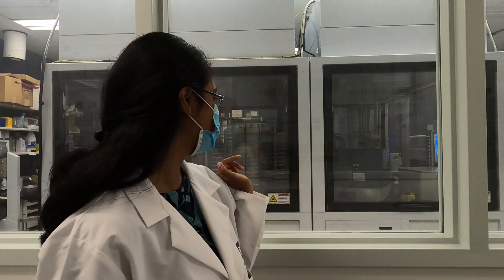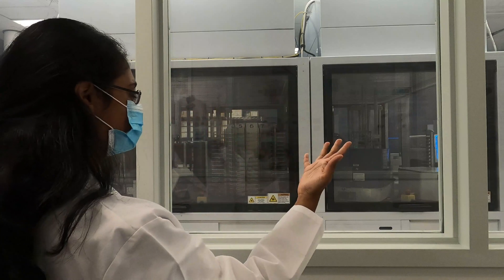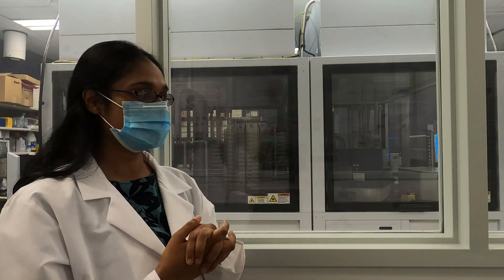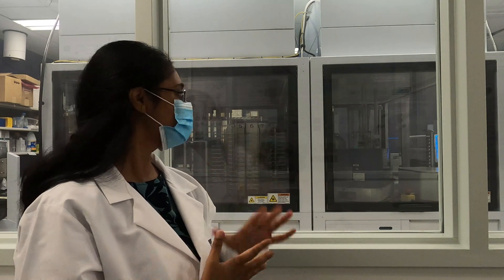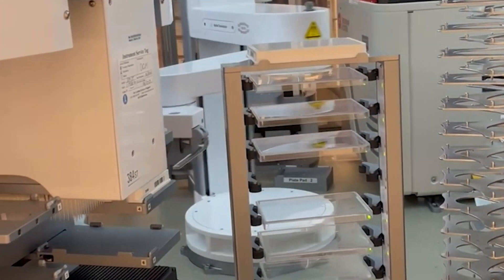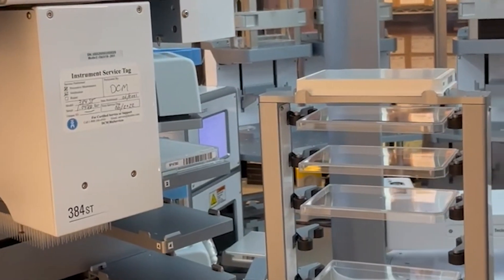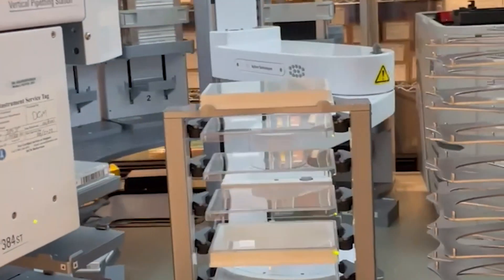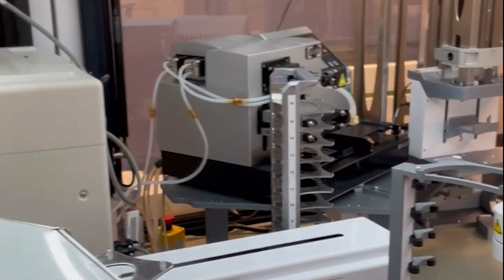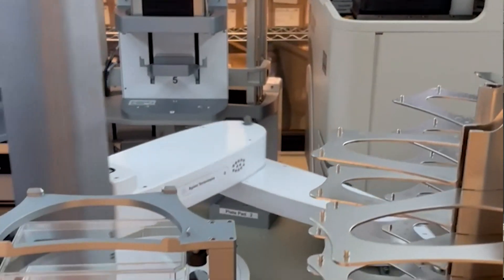To start with, we have behind you here our robot. It's sort of a room that's enclosed. It contains several different instrumentations that our automation team uses with us. We have many different stackers and instrumentations which allow our automation team to take plates and re-organize them into smaller plates or pick out specific FIs that we need. There are plate stackers, a washing station, and a robotic arm that moves everything around for us.